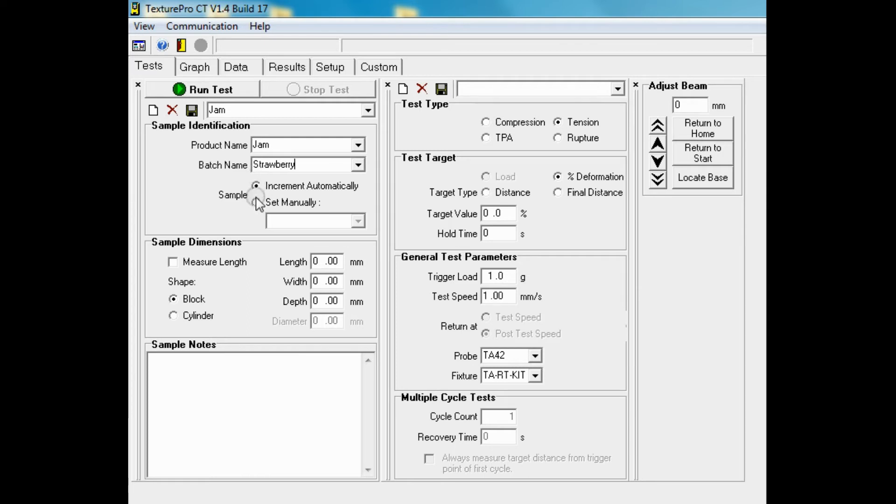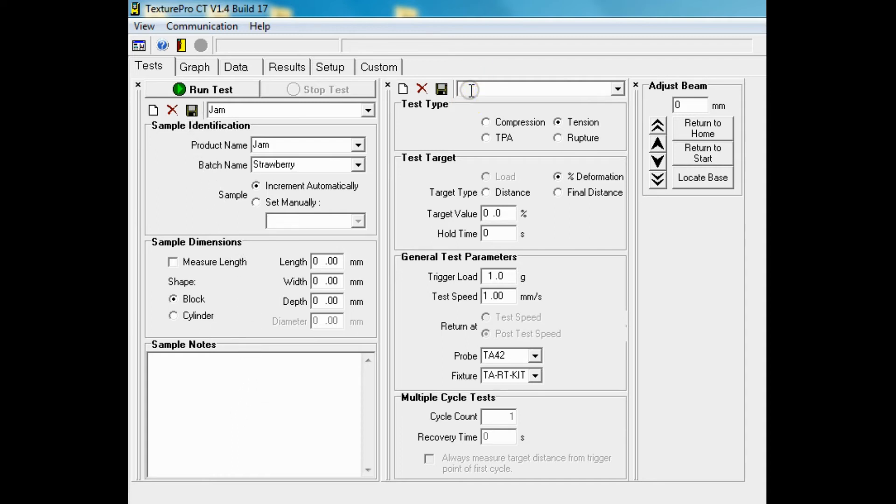Sample dimensions are required if carrying out tests that require this information, such as percentage deformation tests. In this section you can enter additional information about your sample. You can now save and move on to the test settings.